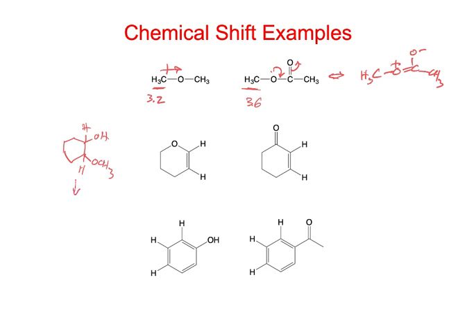However, if you convert this position to an ester, then we'd see this signal would shift. This one would stay mostly the same.